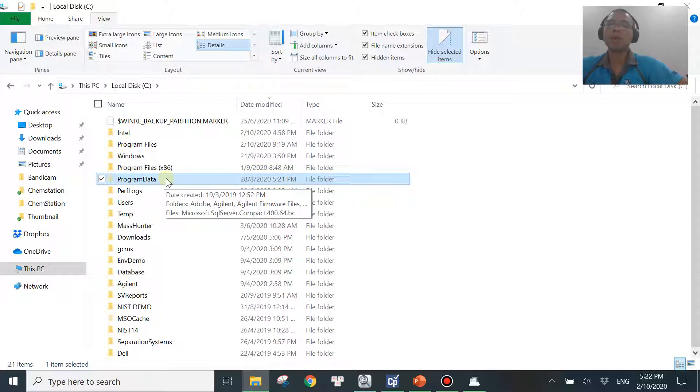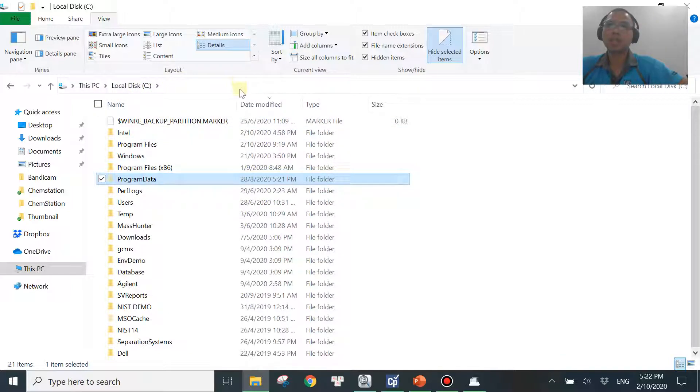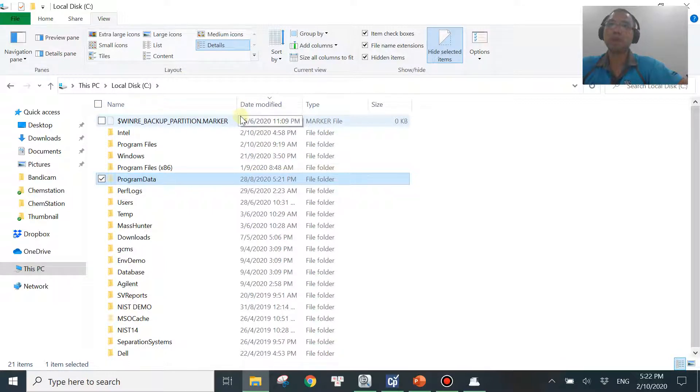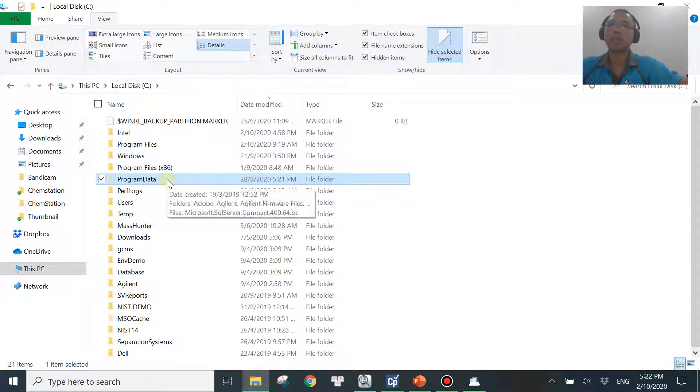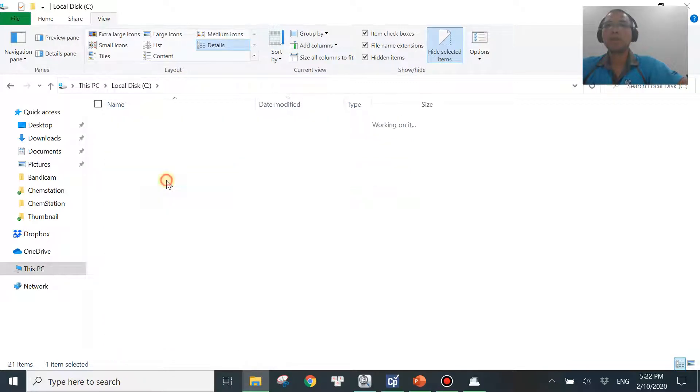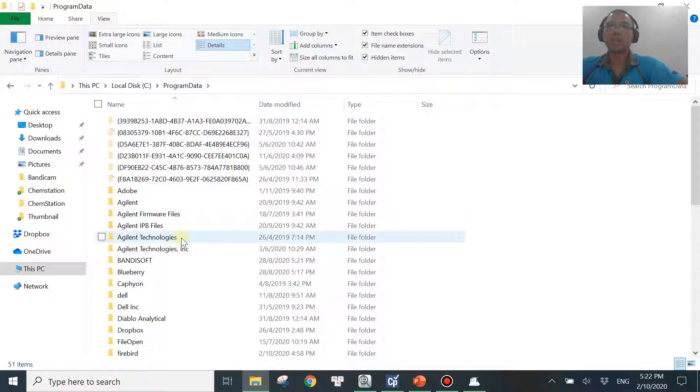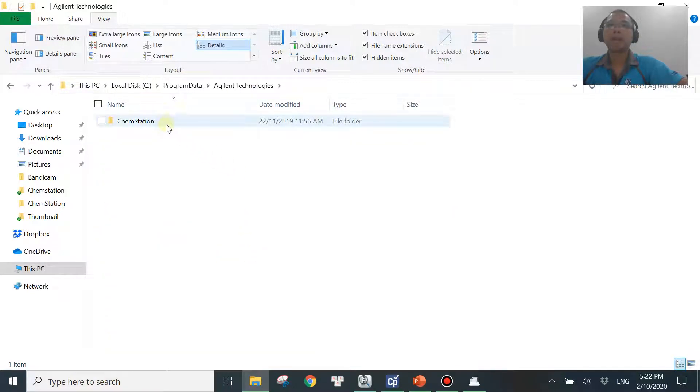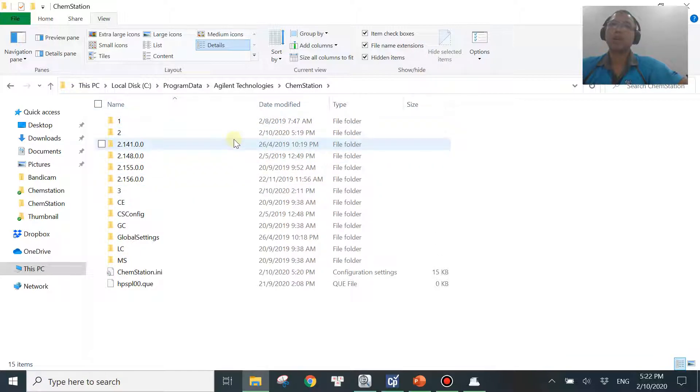So that's why the path to go to the final destination is a little bit different from yours if you are using older version. So if you are using the older version, it will be C, Chem32, and then you will see one, two, three, or four or five, whatever instrument that you are having right there. But if you are using a new version like my C01.10, you'll be going to program data, and then you'll be going to Agilent Technologies, then ChemStation, then there you go. You have one, two, three, whatever instrument that you have over here.